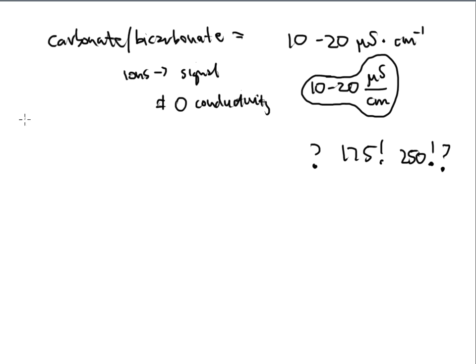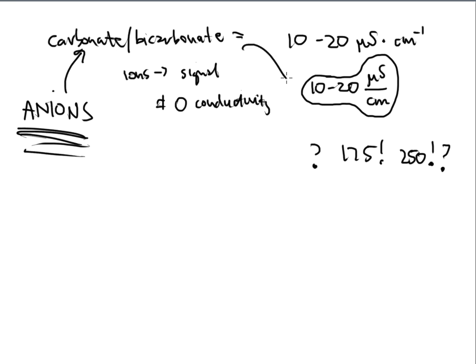All right. So again, I'm going to put in all capital letters here: anions, because they are the ones that use the bicarbonate-carbonate mix, which is the most common mobile phase that will give you that 10 to 20. So every day, if people are making mobile phase in the lab and they load that mobile phase up on the equipment, I'm going to quickly look at the conductivity value of the detector after I'm running that mobile phase through for about 30 minutes.